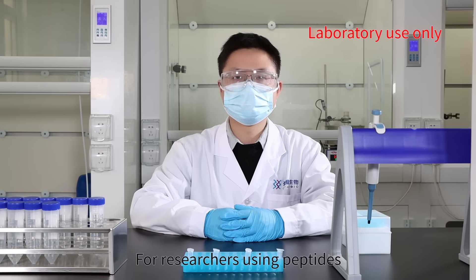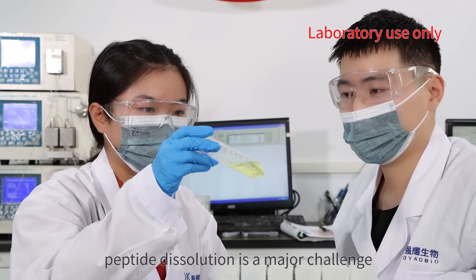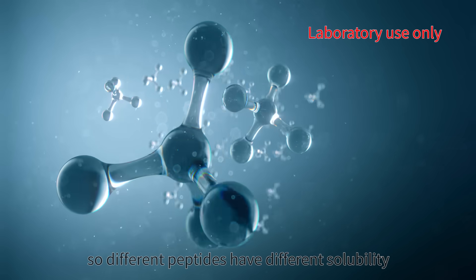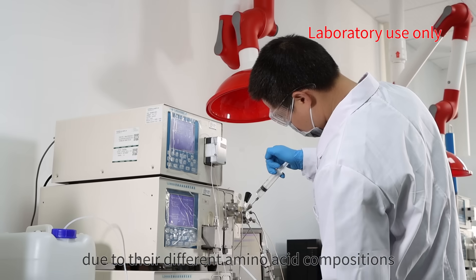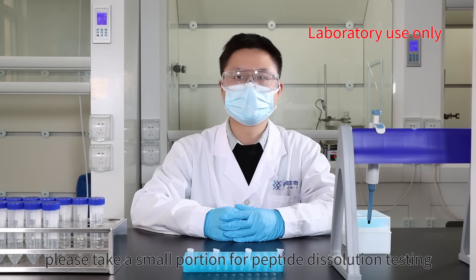For researchers using peptides, peptide dissolution is a major challenge. Each amino acid has its own inherent chemical properties, so different peptides have different solubility due to their different amino acid compositions and arrangement orders.